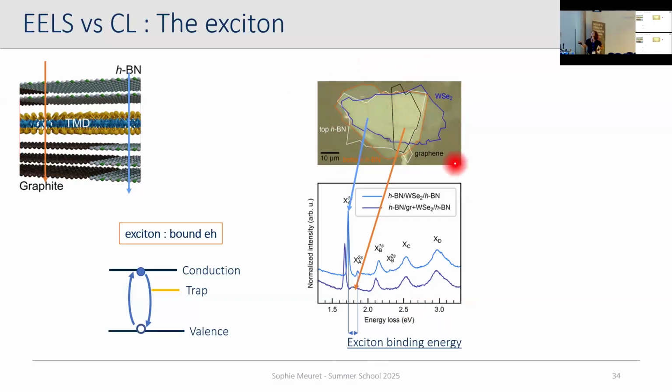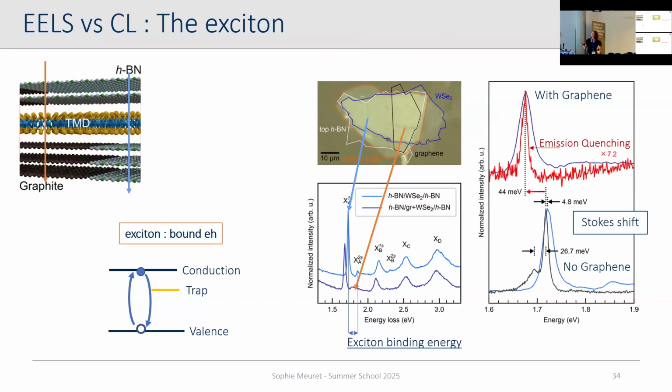Because in optics you would maybe be able to excite all of this, or they would be quite difficult to look at. But also because what you can do is look at CL at the same time, and that's super nice. Here this is cathodoluminescence and EELS. EELS is the nice one that has no noise, and cathodoluminescence is the very messy stuff that you see overlaid.